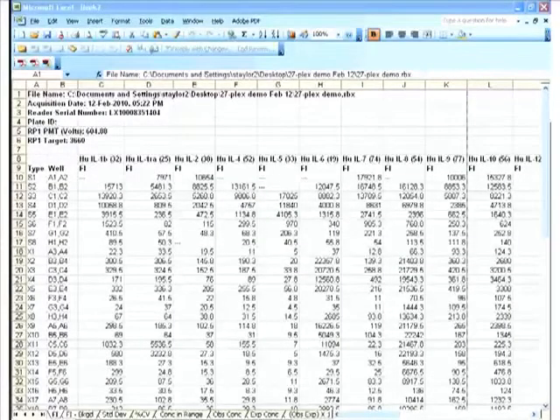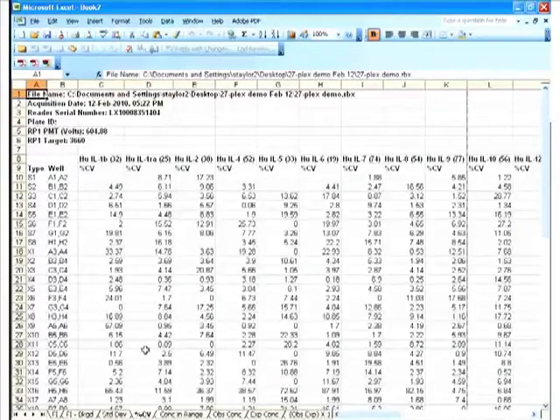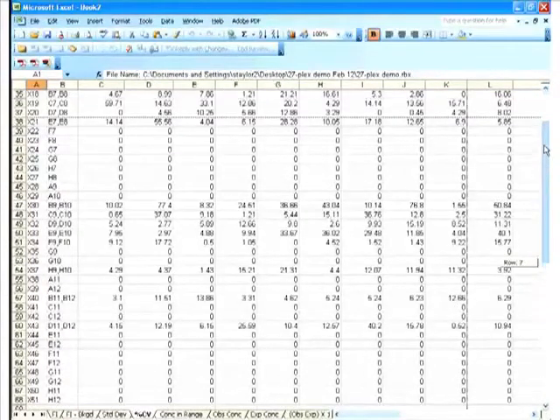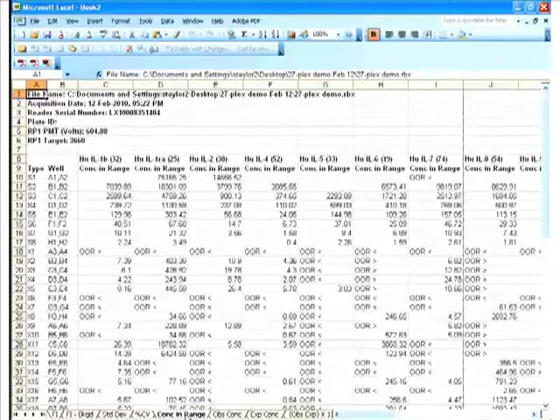And there we go. So now we can look at any one of the raw data characteristics. So raw fluorescence minus background, percent CV if we wish. That could be interesting to see how the percent CVs went across all the analytes for the data points that we had. Or we could look at concentration and range as an example.